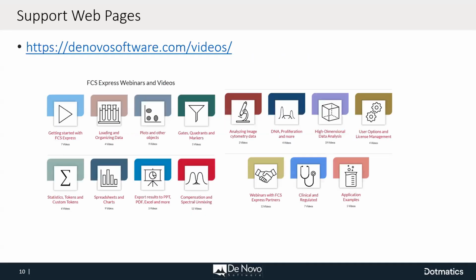Okay. The other thing that we have on our support webpage is videos. So getting started with FCS Express, there are FlowJo videos in there, and when I say FlowJo videos, I mean in the sense of what I'm talking about, but maybe a little bit more detailed, and then also in our compensation and unmixing. But you'll see that we have high dimensional data analysis.